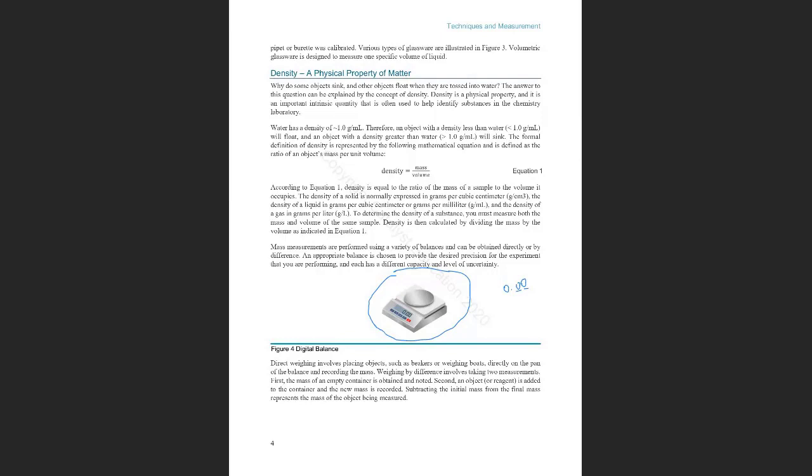There are other analytical balances that are like boxes. They have shields on the side. You measure inside, and you can open the sides, and they can give you 4 decimals, and we have those analytical balances in the TCC lab. We use that. This one is showing just 2 decimals. So we are going to measure an amount of water, measure the volume, and use this formula to calculate the density.